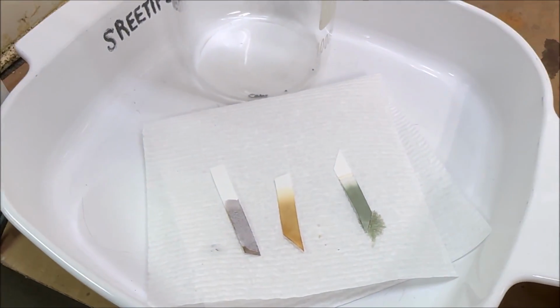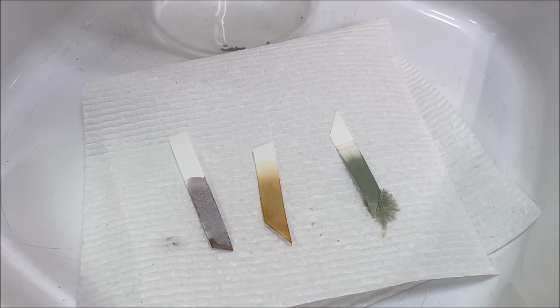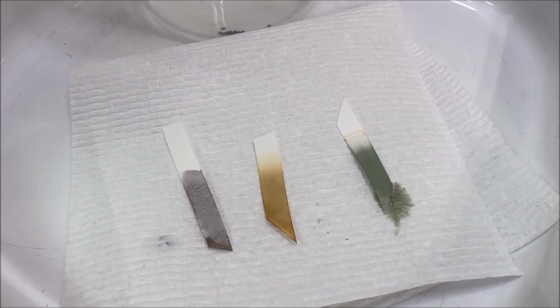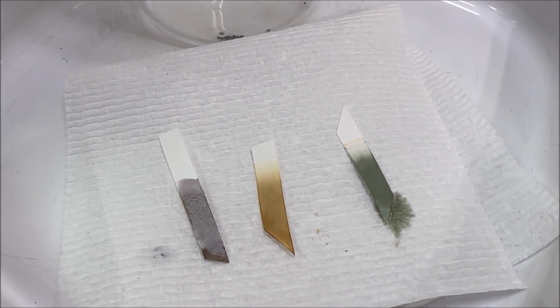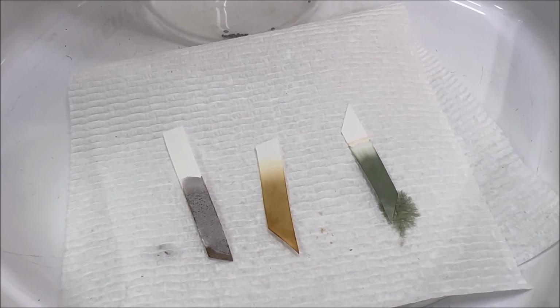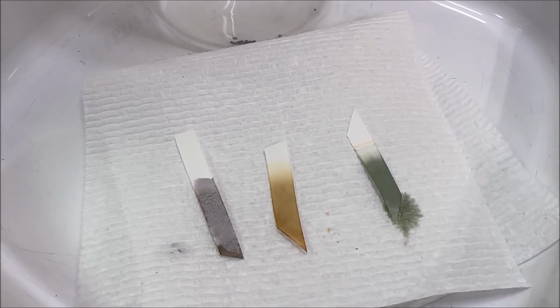I just wanted to show you these tests one more time after they've dried out. The one on the left is gold, the one in the center is platinum, and the one on the far right is palladium.